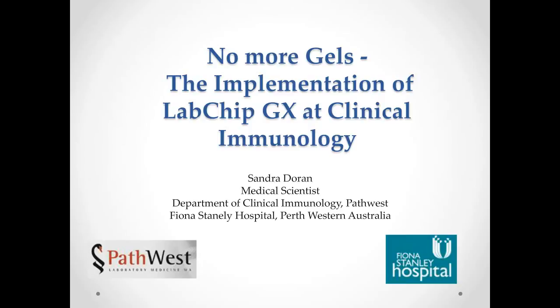In today's web seminar, scientists will present on their experiences in converting from acrylamide and SDS-PAGE gel separation assays to microfluidic or lab-on-a-chip technology. Lab-on-a-chip technologies have been around for around a decade and have been adopted as industry standard, particularly in the biotech and pharma environment. The largest community performing nucleic acid and protein separation is, however, the academic research community, and mostly they are running traditional gel methods. The goal of today's session is to demystify this area for everyone, including the academic researchers, about the alternatives available and the possible benefits that they can bring.